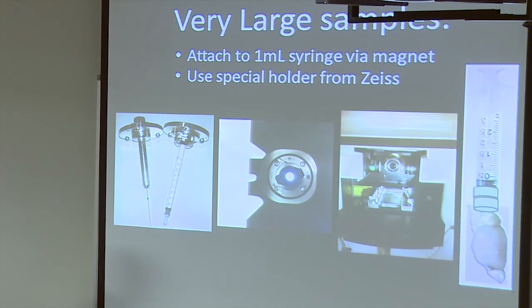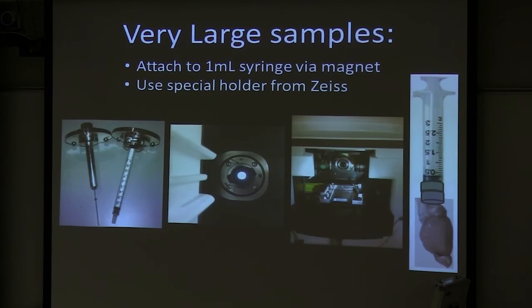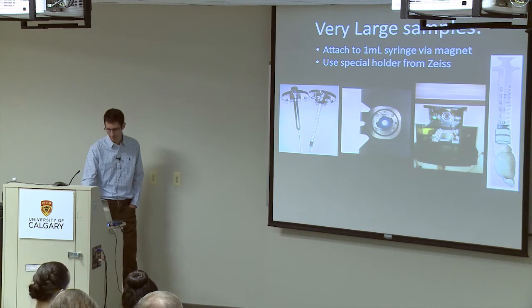And the other dimension, in the Z dimension, you can get through usually about 4 millimeters in really well cleared tissue, sometimes 4.5 if you're lucky. And then you've got to rotate it 180 degrees and go from the other side. Okay? So again, there you're limited to just under 1 centimeter in the Z dimension.